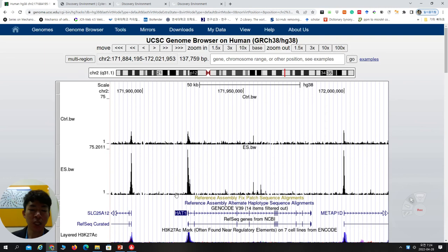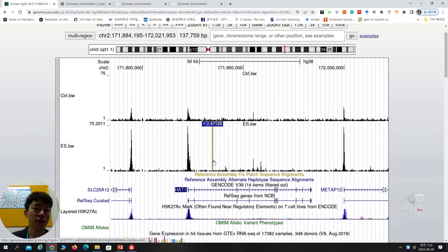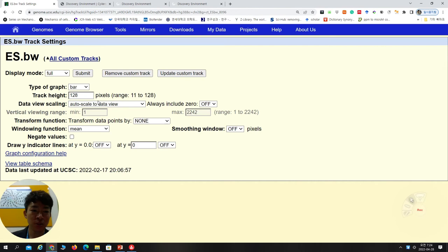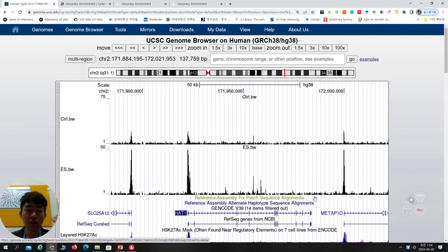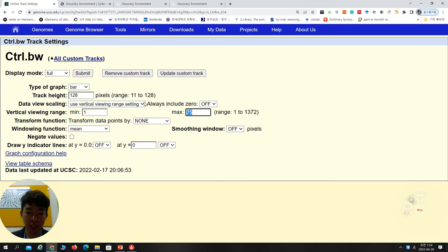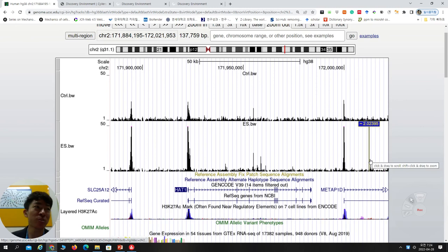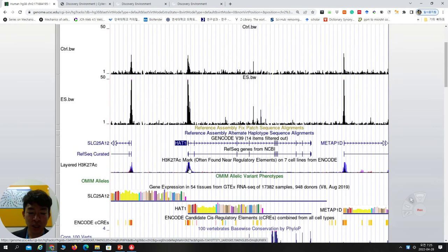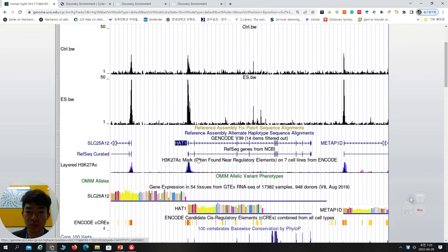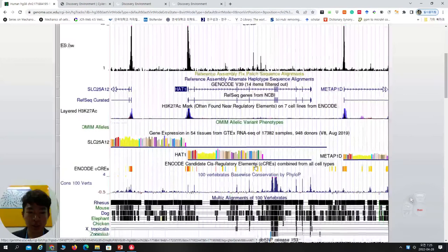Now you can see — for the HAT gene, which one is more highly accessible? The ES group. You have to match the scales. Sometimes people, to highlight their findings, will show a mismatched Y-axis. But when I set the ES group's Y-axis to 50 instead, you can see the pink track is cut off beyond the Y-axis. When you change to the proper scale, you can show the data better. Like that, you can see that the HAT gene is more accessible after ES. This region is related to the promoter region, and they transcribe to the right. This is the exon and this is the intron side.